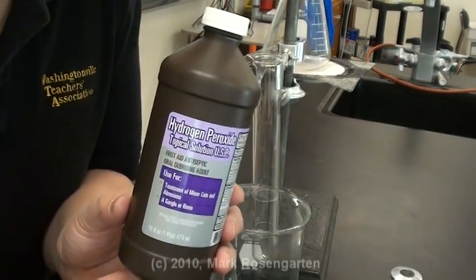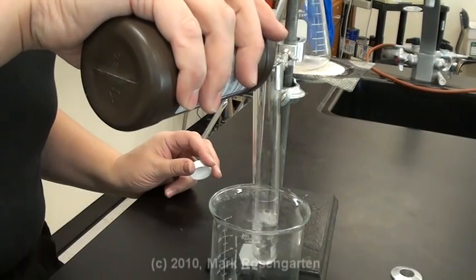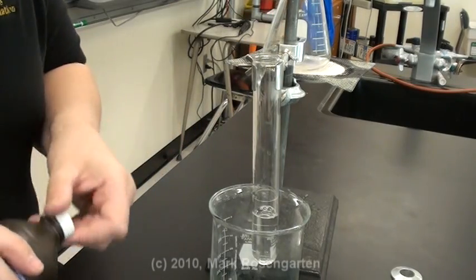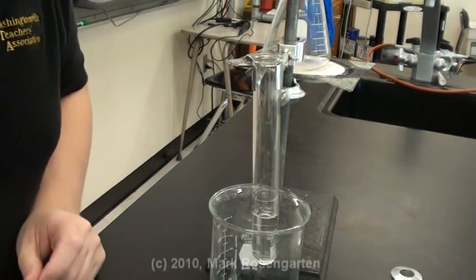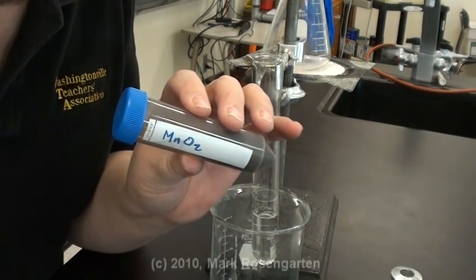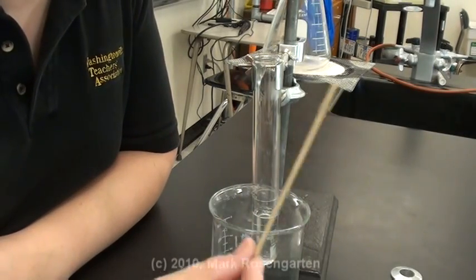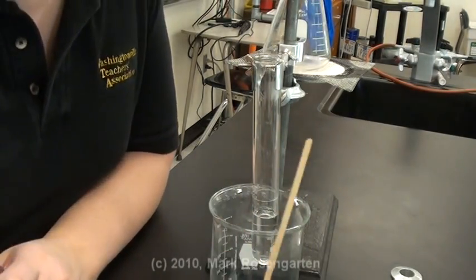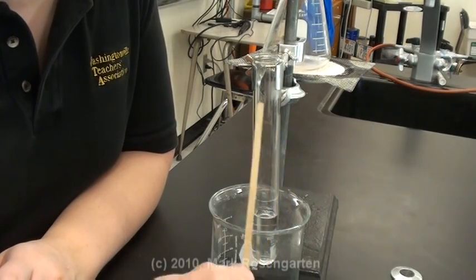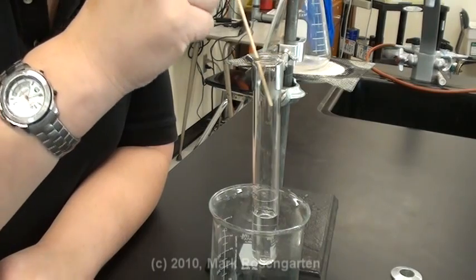Here's your hydrogen peroxide. We're going to decompose it by adding a catalyst. The catalyst we're going to use is manganese dioxide. We're going to test for the presence of oxygen gas by doing the glowing splint test. I'm going to take this wooden splint, light it on fire, blow it out, and then I'm going to take that glowing splint, put it in here.